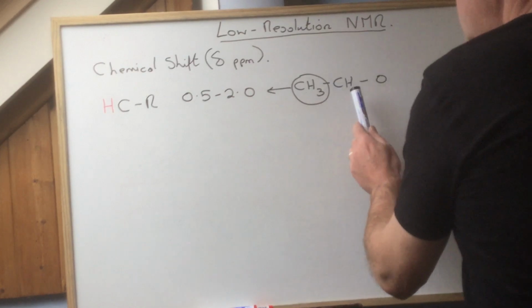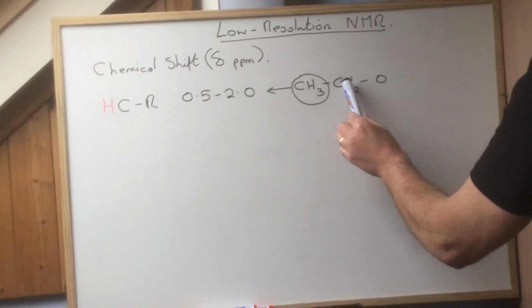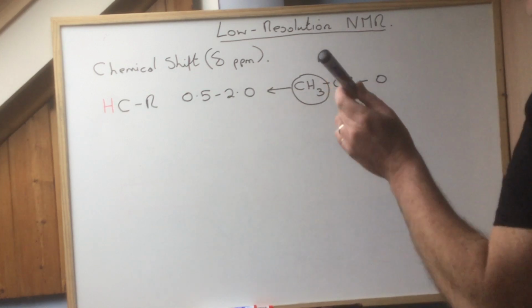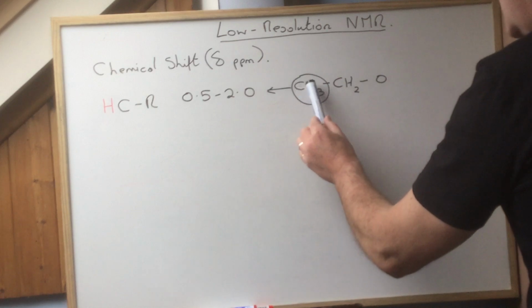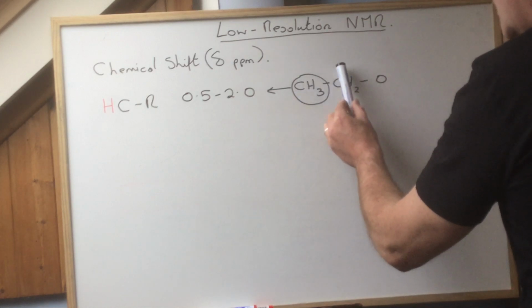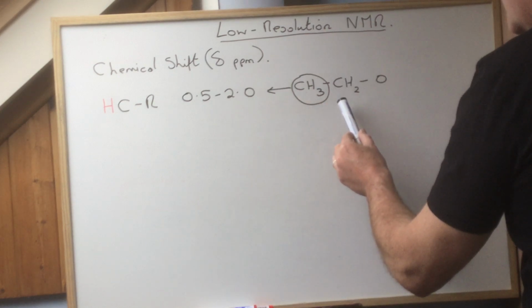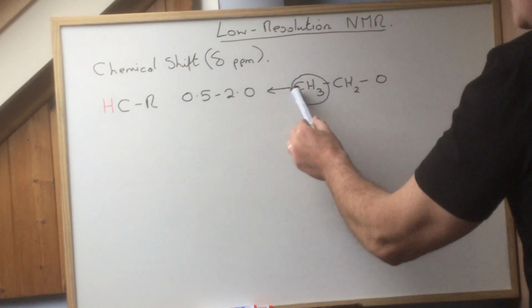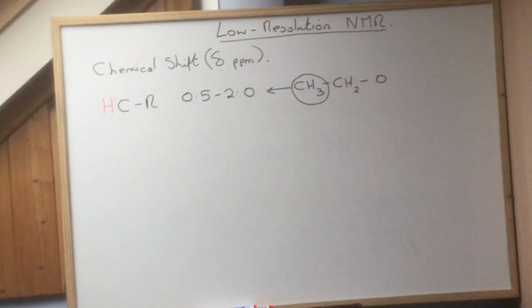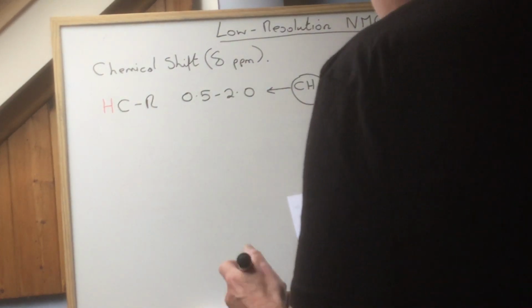That looks misleading. These protons, they're attached to a carbon which is attached to an oxygen, so they are on a different chemical shift, which we'll come to shortly. But these three here are attached to a carbon that is attached to a carbon with H's on. Okay, they're part of a carbon chain, so they will have a chemical shift in that area. A nasty one really to start with, but we'll get the hang of it.